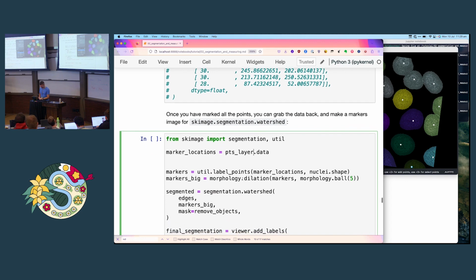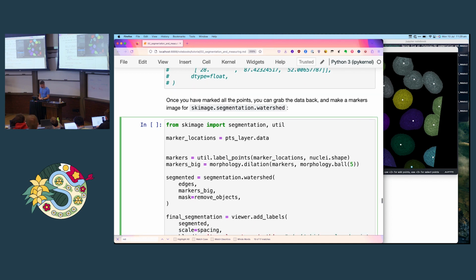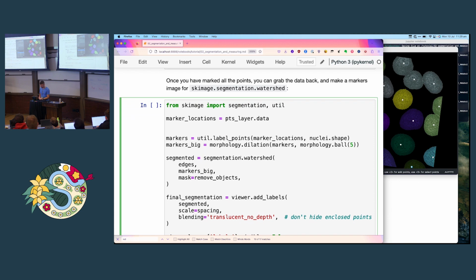And now I'm going to go back to 2D so I can grab that label. I'm going to do a color picker. So I pick that label. And then I'm going to add the fill. Now, by default in 2D, I'm only editing 2 dimensions. So I can say now fill in all 3 dimensions of the data. Okay, and now I have that. Okay, so now if I go back to 3D, I have my, oh no, I filled that one. Please tell me undo's not broken. Undo's not broken.